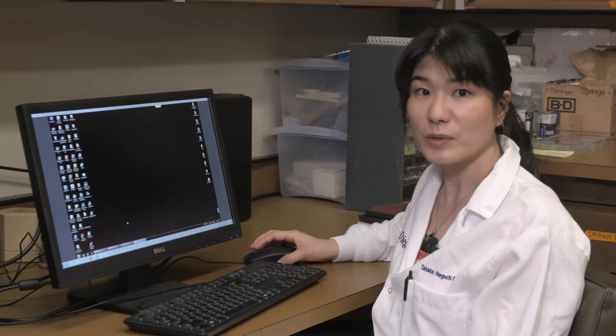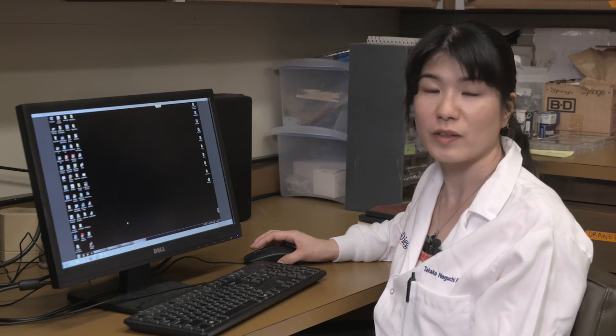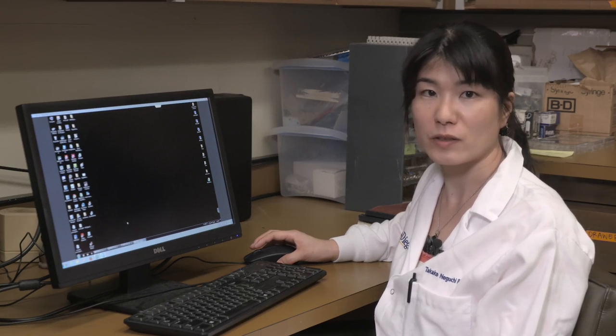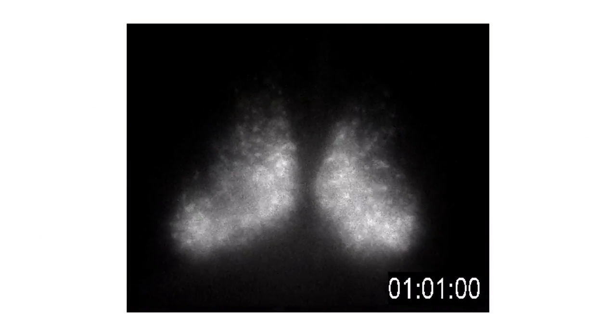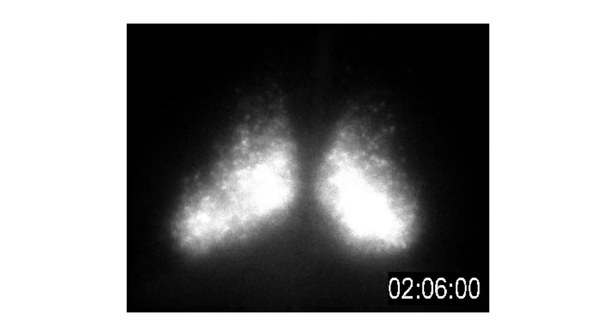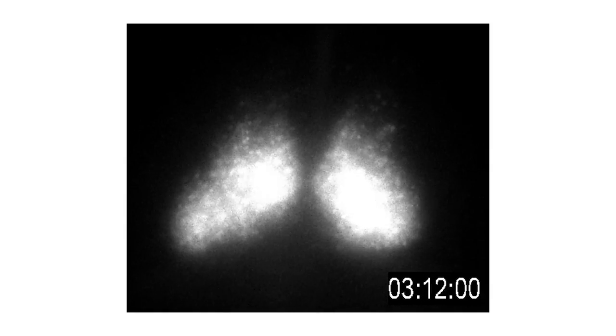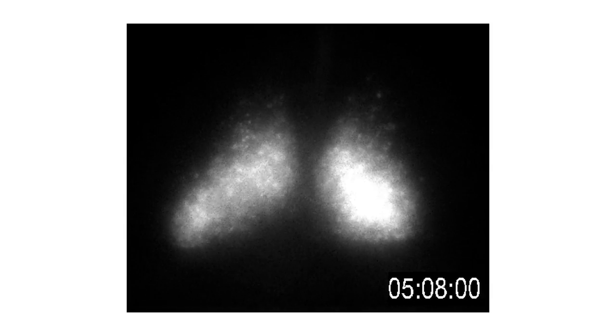Every 30 minutes, we take a picture with a 29-minute exposure time of that bioluminescence. After several days of recording, we compile the images and create a video or a stack file to observe how PER2 luciferase was expressed throughout the SCN over time.